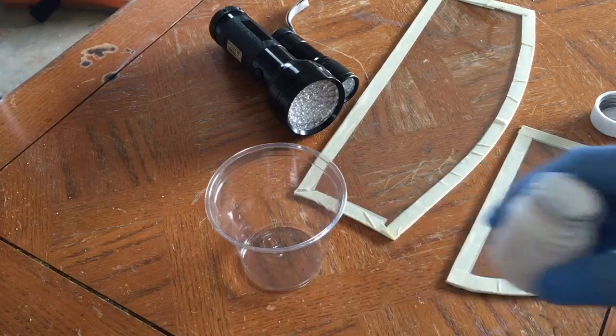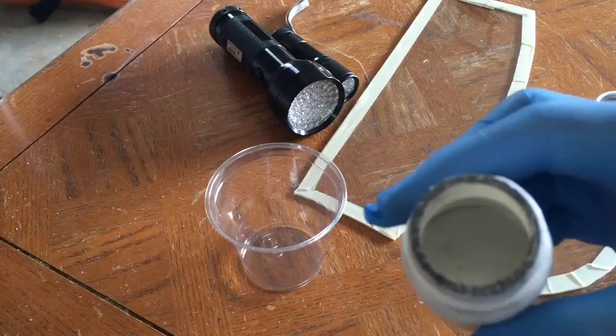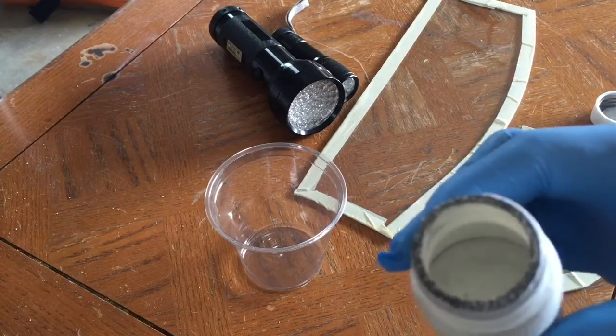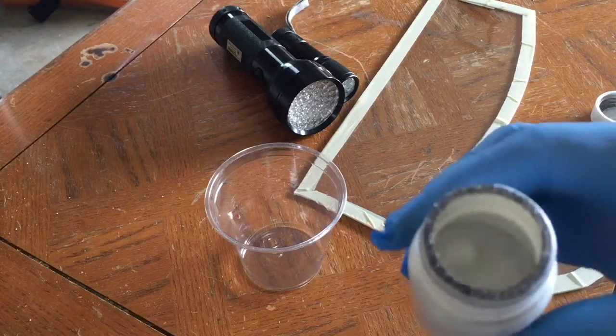Hey and welcome to this video. I'm going to show you some more experiments with gallium. Gallium is a liquid at room temperature but solidifies when it starts to cool slightly.